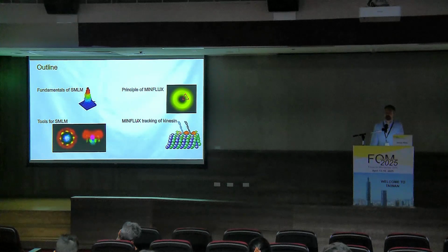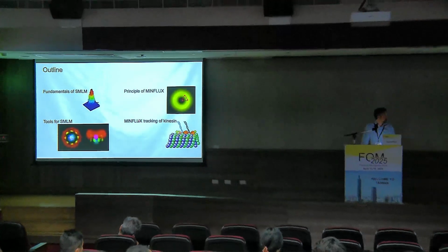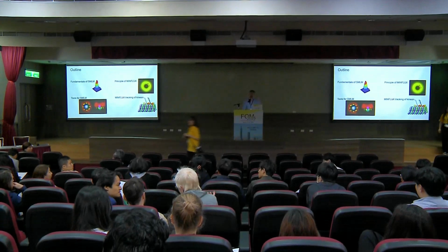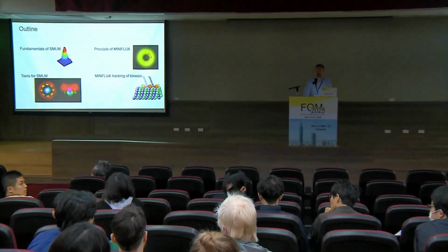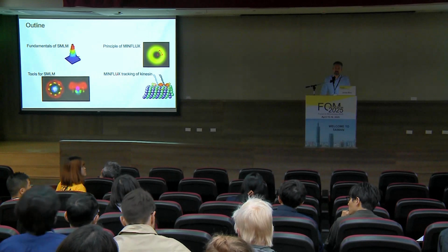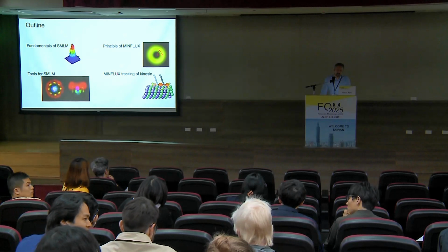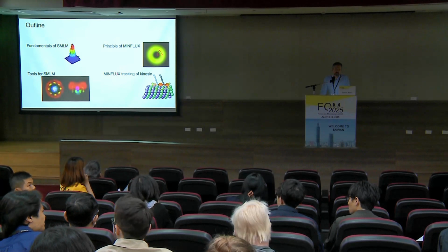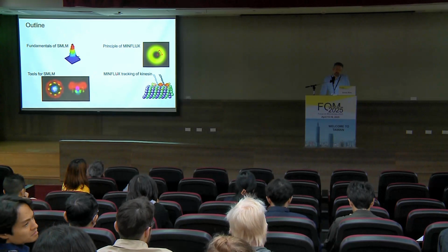Questions? Thank you for that, Michael. Can you do dual-dye labeling combined with something like DNA-PAINT and check them for dynamics of other things in this? Combined with what? Combined with something like DNA-PAINT, and just use MINFLUX to track things like that, so you can track other things with DNA-PAINT.